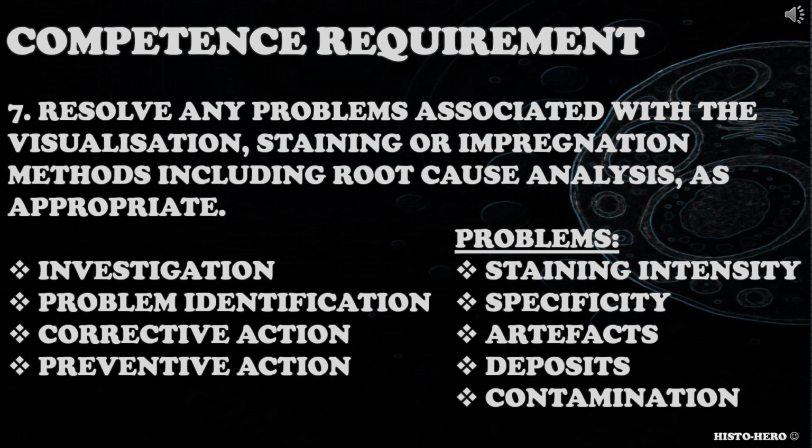Consider possible problems like poor staining intensity, poor specificity of staining, artifacts like uneven staining, hazy slides, presence of deposits or precipitate on the slide, reagent contamination, and so on.